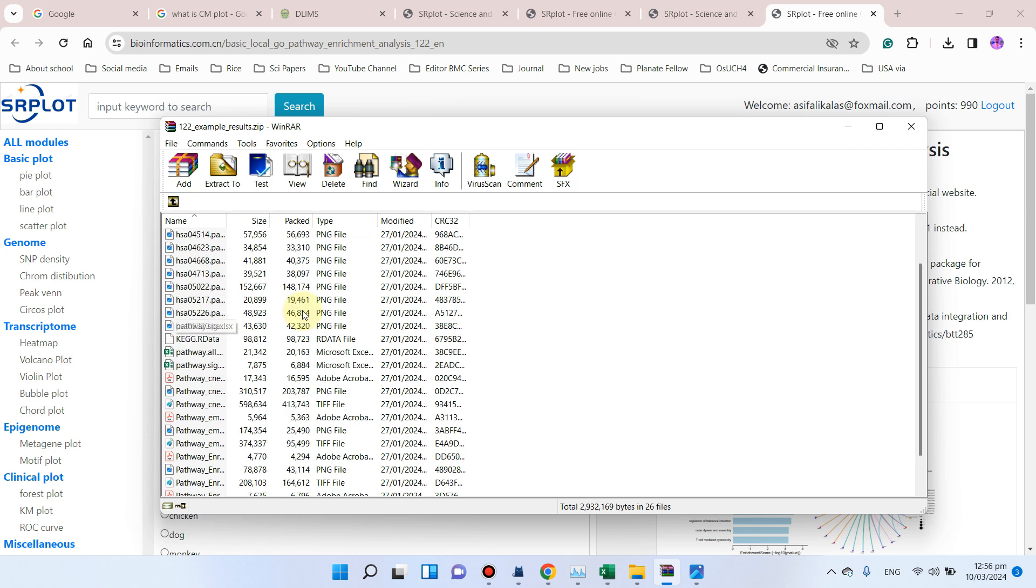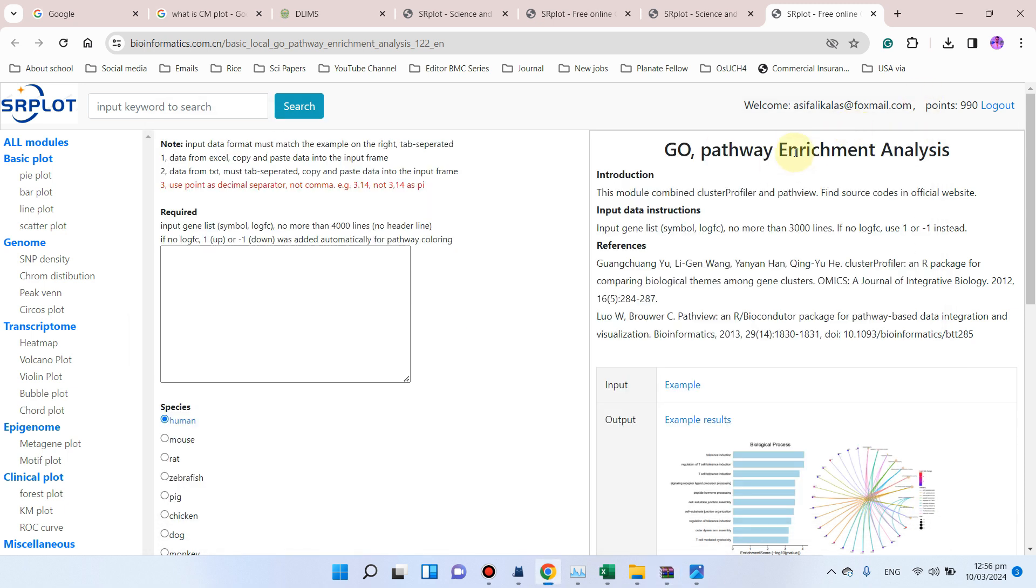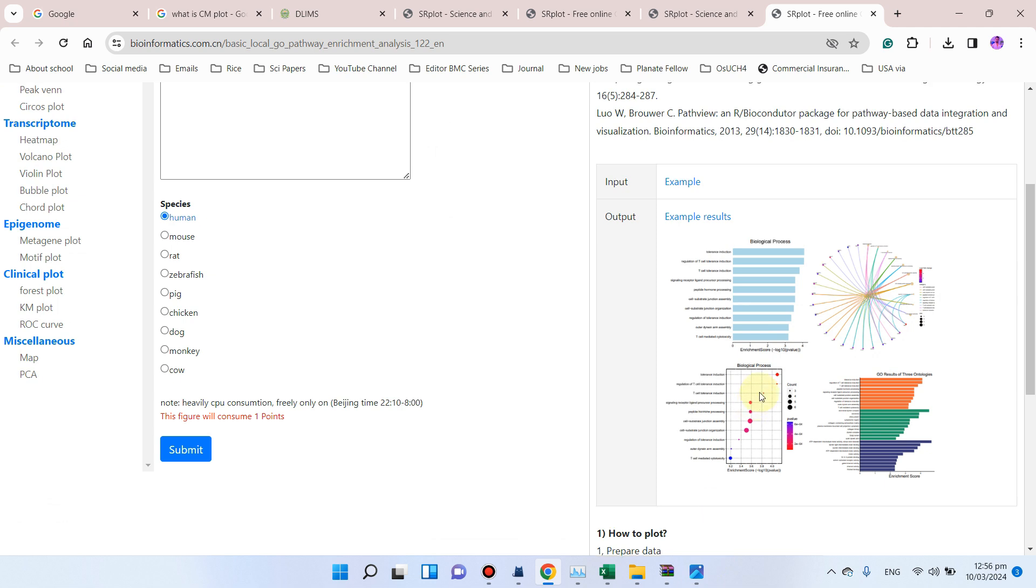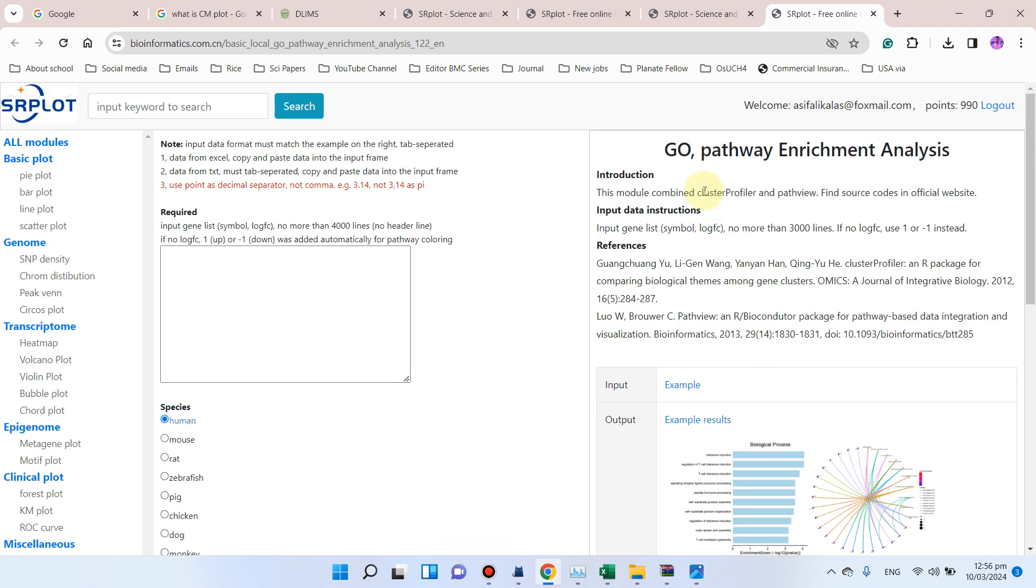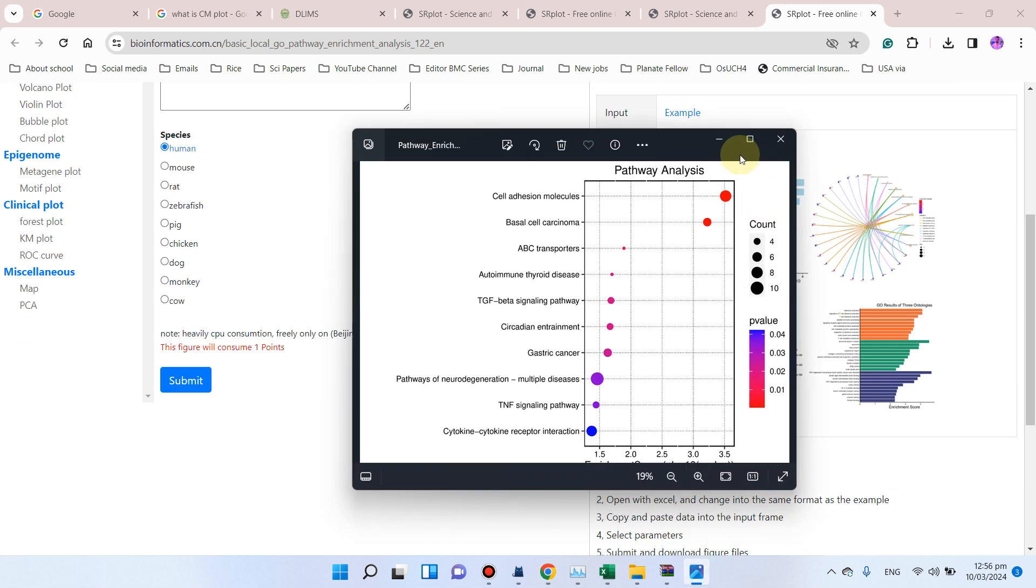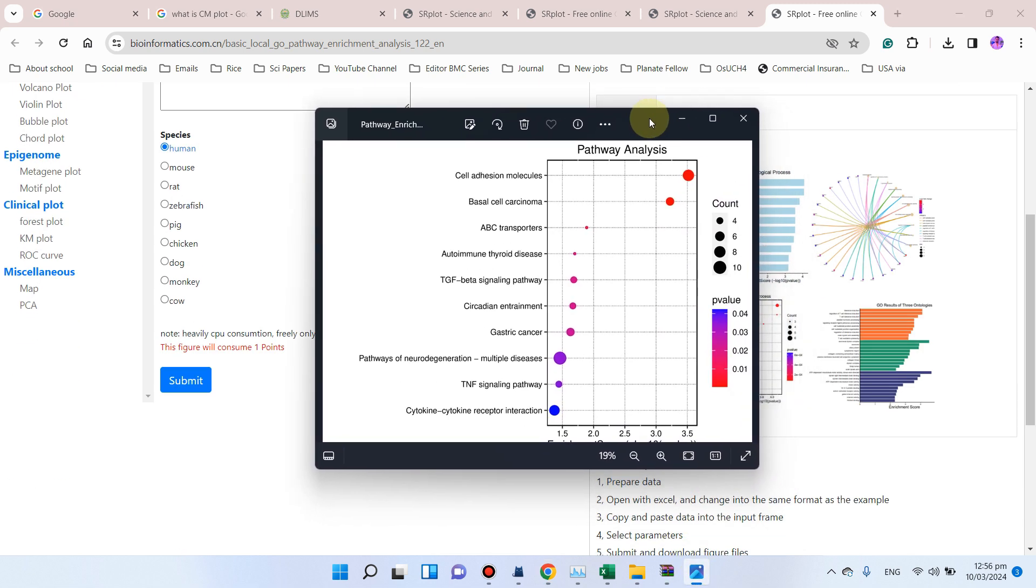Similarly, you can see here we have all the pathways which were enriched for those genes which you have placed, and it will also include figures like this. This GO pathway enrichment analysis will be conducted using combined material of cluster profiler and path view, so you will also get your pathway enrichment analysis in the form of this figure.